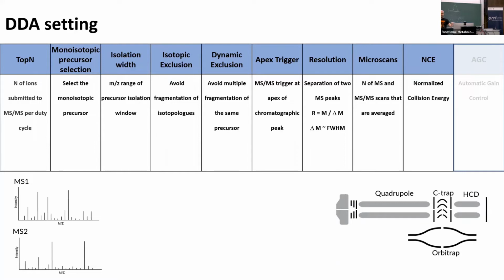There is an important thing. We can use stepped collision energy, so that actually activates ions at different energies, which I particularly like because you never know what the ideal collision energy is. If you do that step thing, you hit it a little bit with everything and typically get a little bit richer spectra. Again, that depends on the instrument you have. Some can do stepped collision energy, others can't. So you need to figure out what's best.